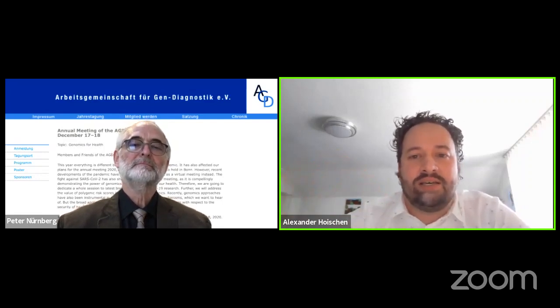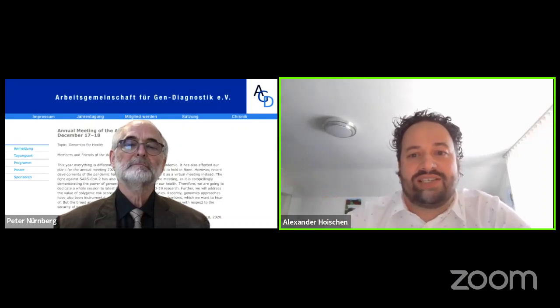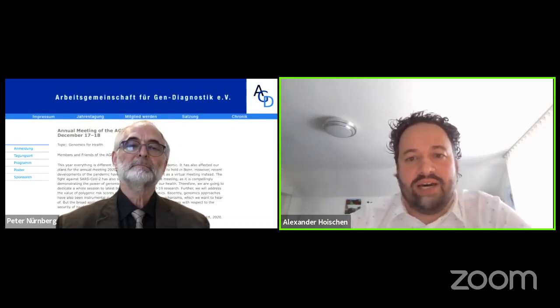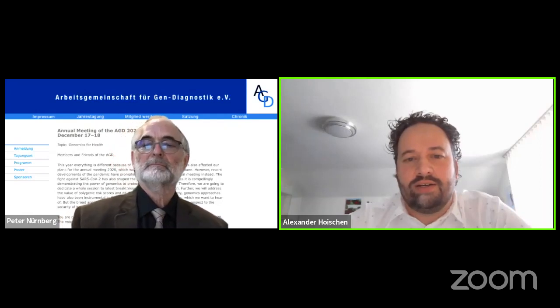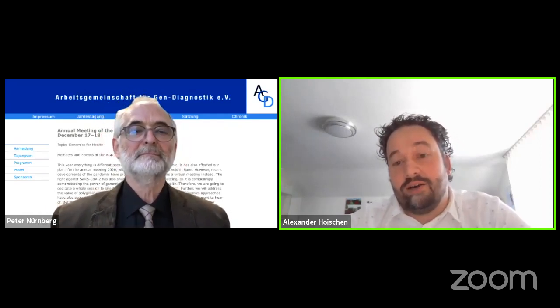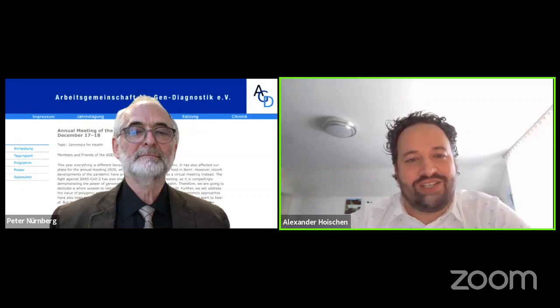It's relatively easy. We don't need massive bioinformatics, or no, actually a bioinformatician is heavily involved at the moment in-house because we rely on the software of Bionano, which has improved quite a bit. So the ease of use is probably the big argument here. And the bioinformatics complexity of all the new methods is still quite relevant. So I think we use all of those a lot, but more for research and not so much in a clinical setting yet.